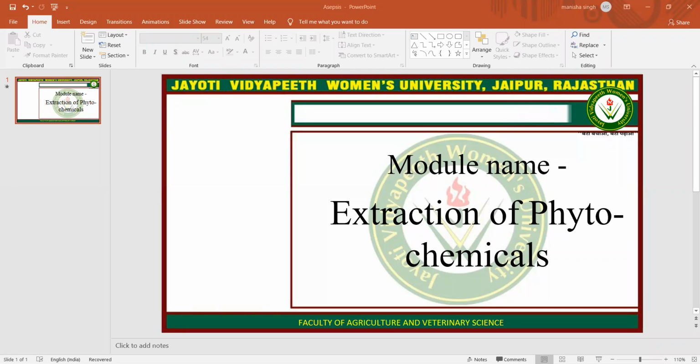Today I am teaching you extraction of phytochemicals. So let's start with the extraction. Extraction is the separation of medicinally active proportions of plant tissues using selective solvents through standard procedures. The products so obtained from the plants are relatively complex mixtures of metabolites in liquid or semi-solid state or in dry powder form and are intended for oral and external use.